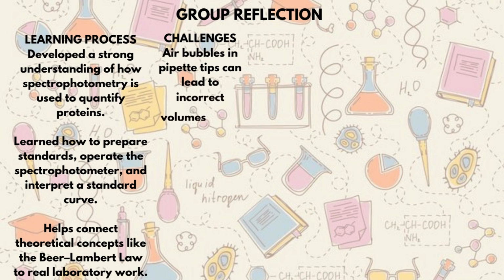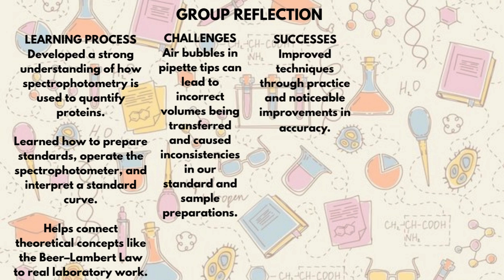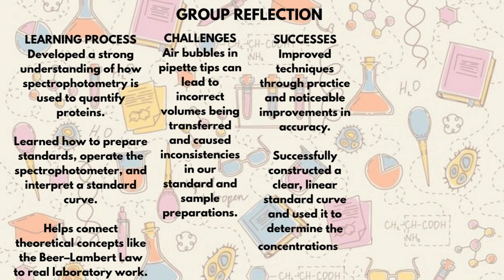Unfortunately, there is a challenge that we faced during the practical, where air bubbles in pipette tips can lead to incorrect volumes being transferred and cause inconsistencies in our standard and sample preparations. But we managed to improve our techniques through practice, with noticeable improvements in accuracy. We successfully constructed a clear linear standard curve and used it to determine the concentrations of the unknown samples.